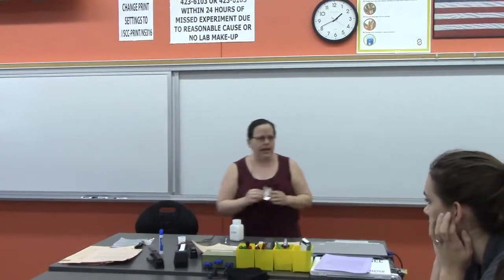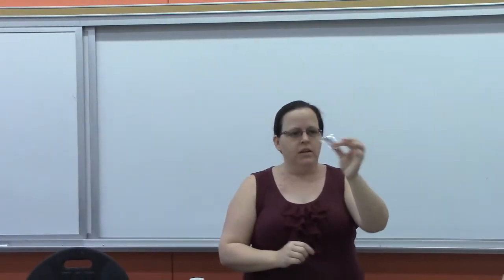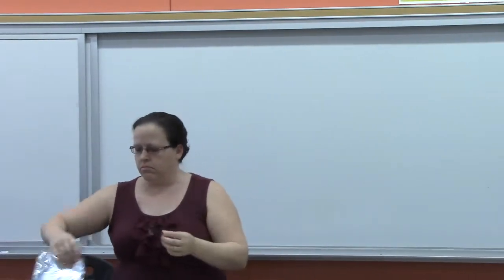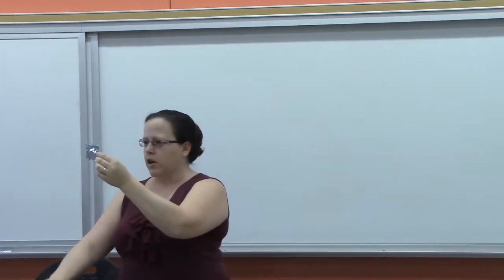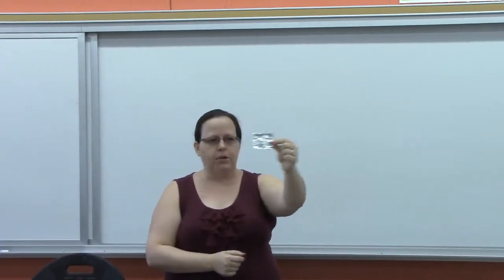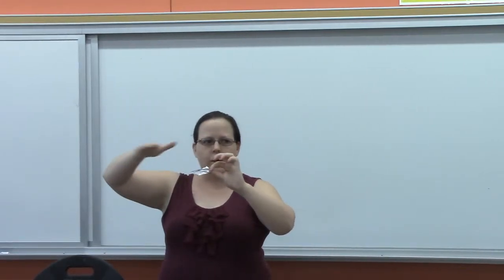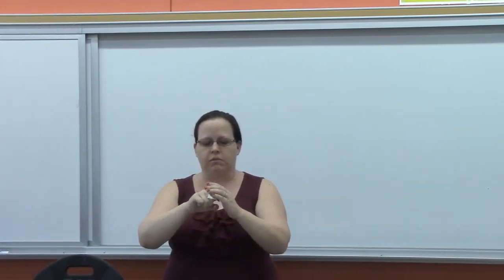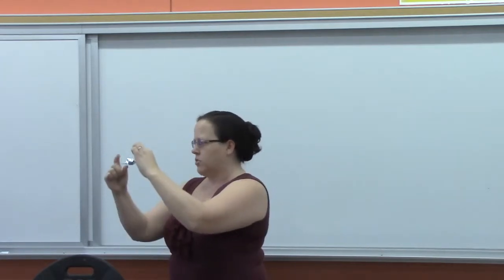You are going to take a small sample of each of those substances in a little piece of aluminum foil. Cut a piece of aluminum foil off the roll, and you can cut it down into smaller pieces. About like that is the size that you want for your sample. Rather than being completely flat, we want it to be slightly curved. Just mold it around your knuckle a little bit so you have a little tiny bowl. That's as much as you need, okay?